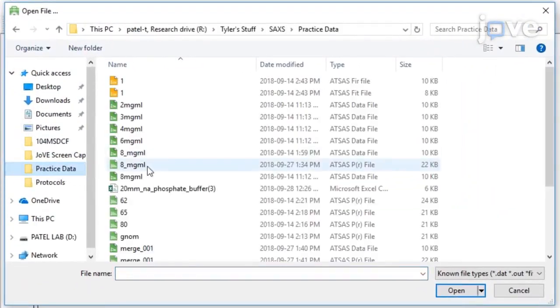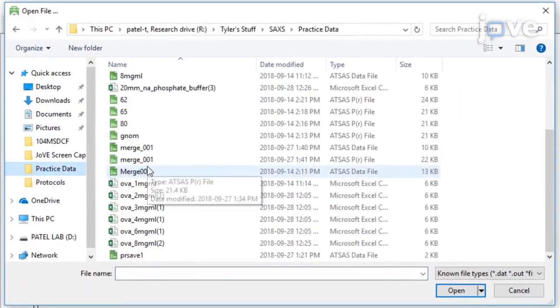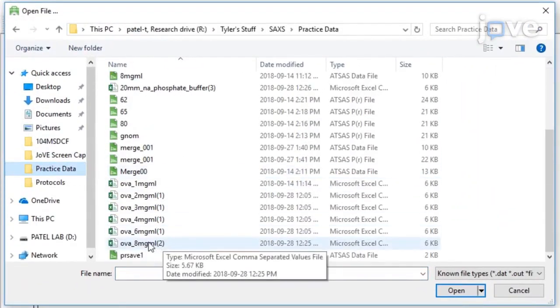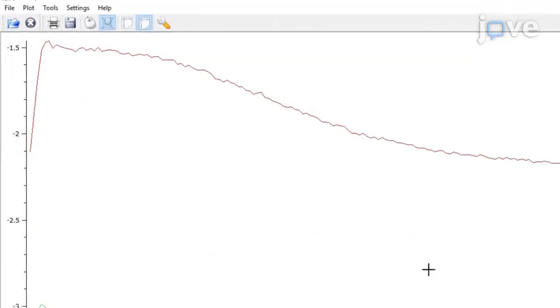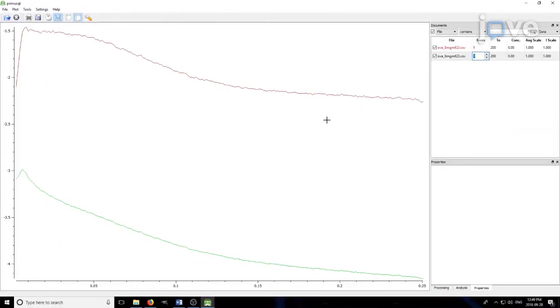Here, select up to 13 data files of interest. The data files must be in ASCII format, in which the first column is the S-vector axis and the second column is the intensity.